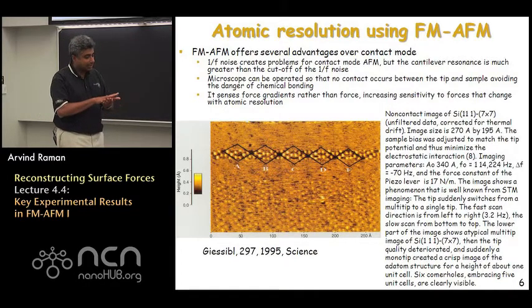When these kinds of images were taken, the tip itself was constantly undergoing transformations, and the atomic structure of the tip might actually change. You might go into a region where a single tip, which is basically an adatom coming out of the surface, is imaging the surface, and then that single tip might get removed, and another structure of atoms with multiple tips may come out, which would lead to entirely different images.